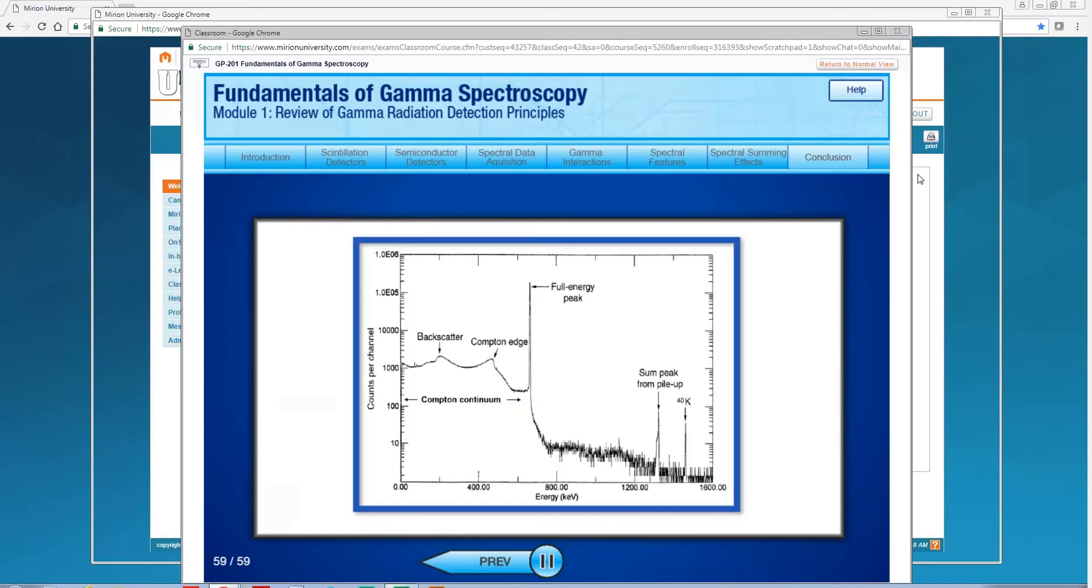Various features we commonly observe in our acquired spectra include full energy peaks, the Compton continuum, the Compton edge, and summation peaks due to random coincidence summing and true coincidence summing.